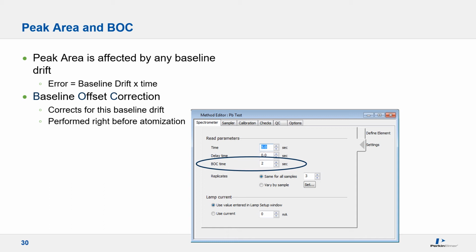One is to increase the BOC time to 3 or 4 seconds if you have an older lamp and believe the message is due to lamp instability. However, if this message is generated from a sample where there is still matrix being removed during the BOC measurement time, generating the error, the remedy is to add time to the pyrolysis step in 10-second increments to allow greater time for this process to occur before the BOC measurement actually takes place.